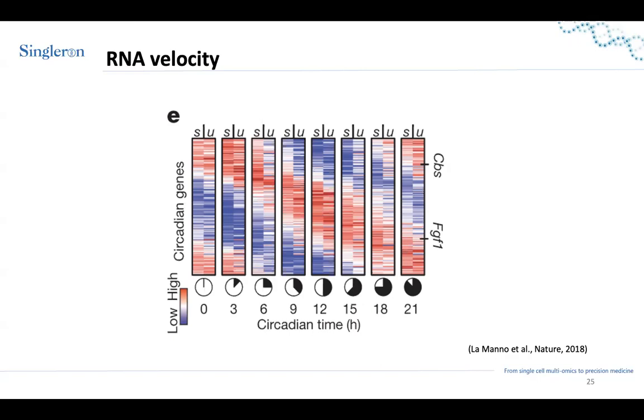Yeah, that's a good question. In bioinformatic analysis, we always need to have some biological knowledge. The bioinformatic analysis, or trajectory inference if I stick to today's topic, will help you to discover things that you don't know. But you need to start with something that you know. So you have a certain biological question, you should have a minimal knowledge. I think it should come from the literature or from pilot experiments, etc.